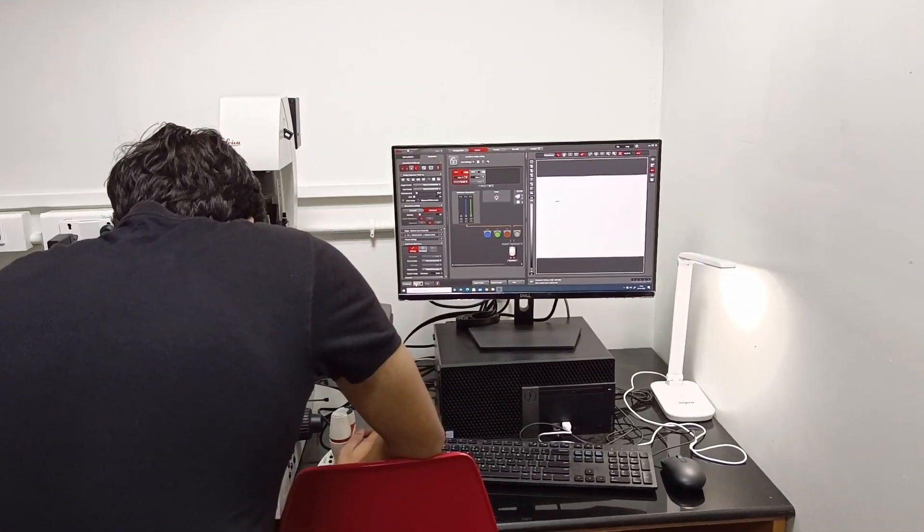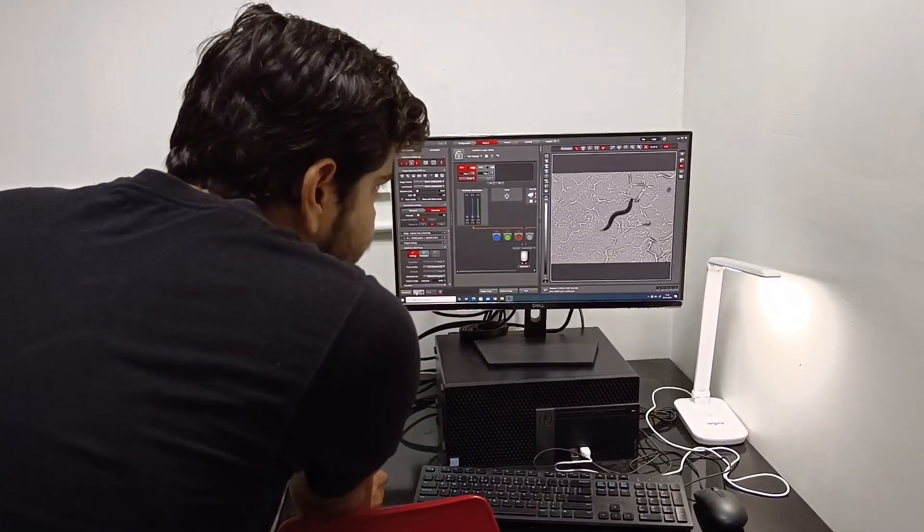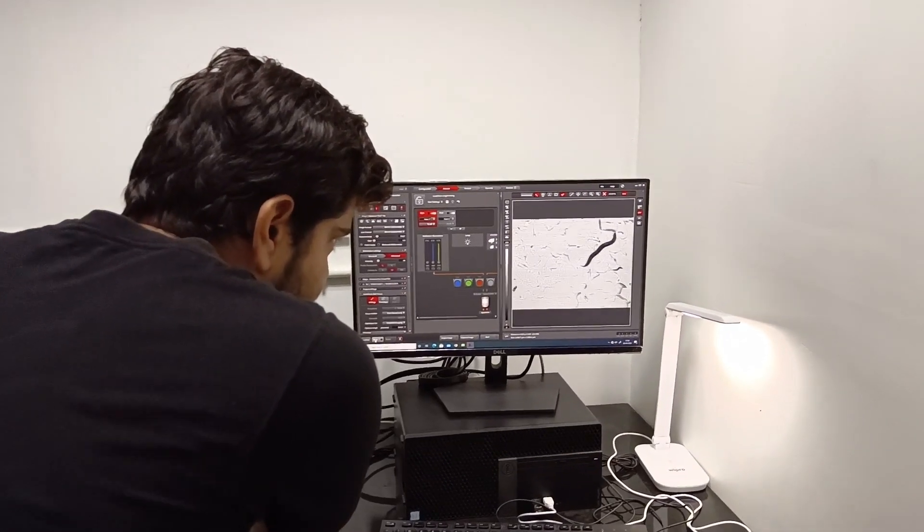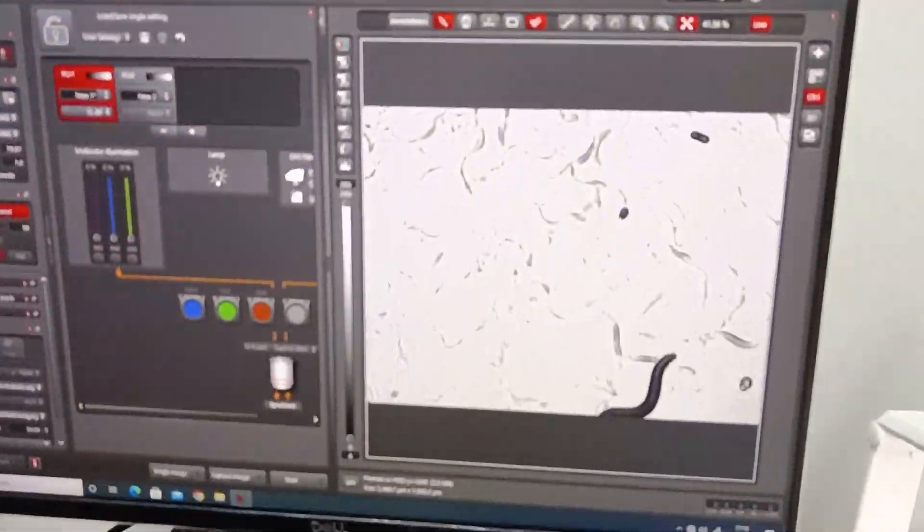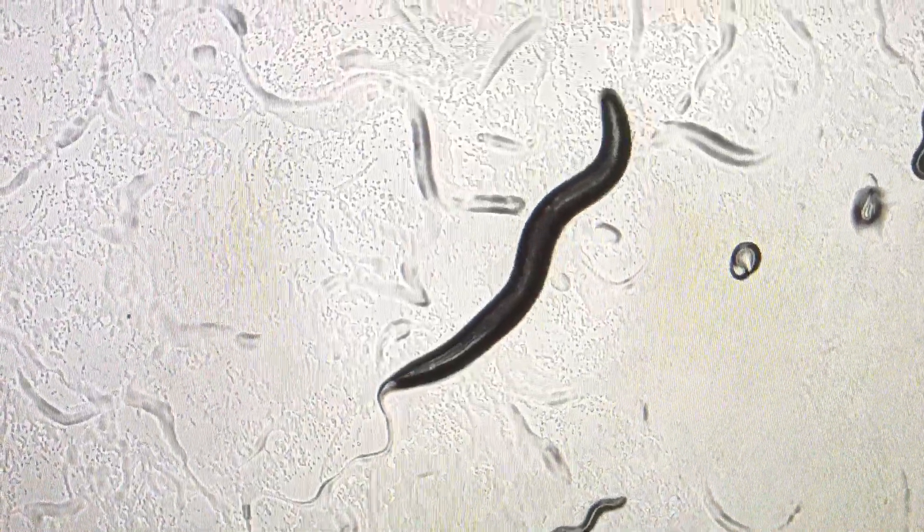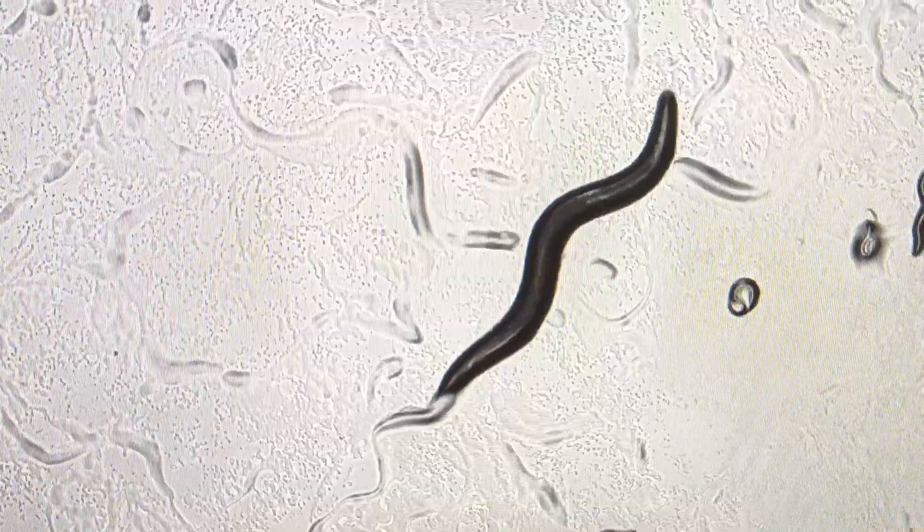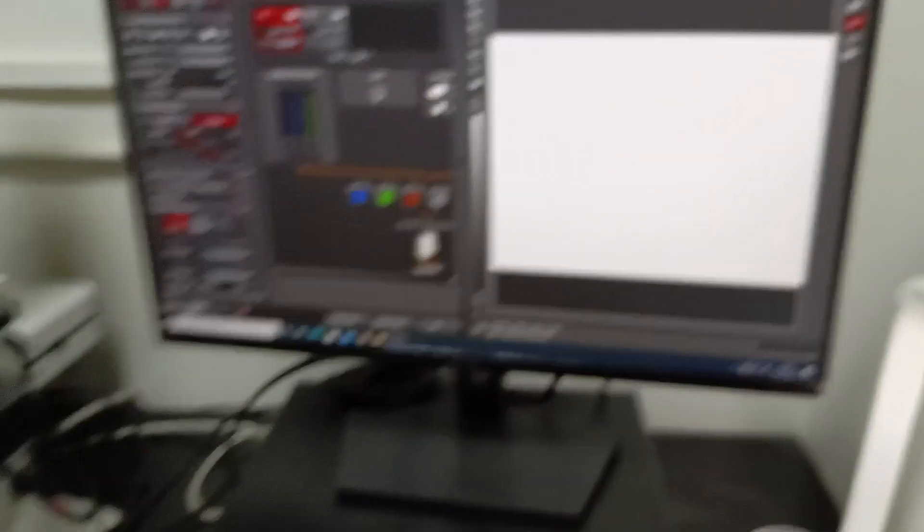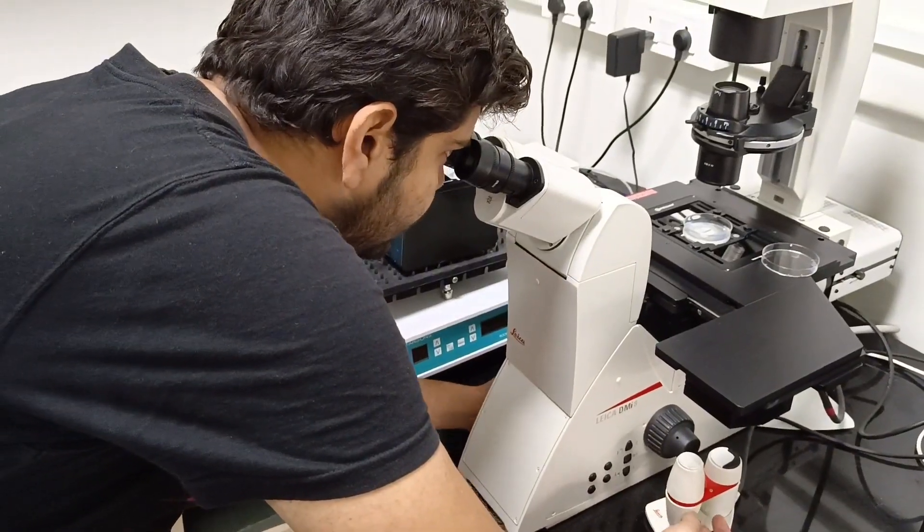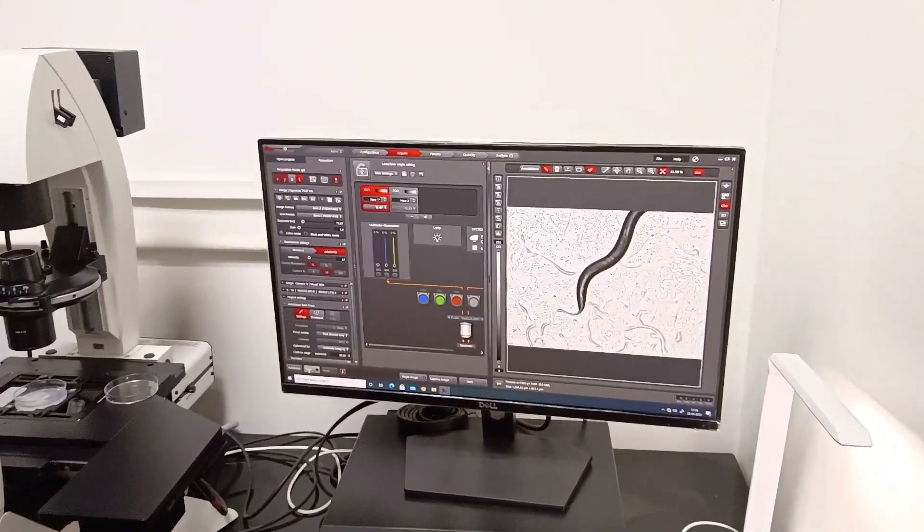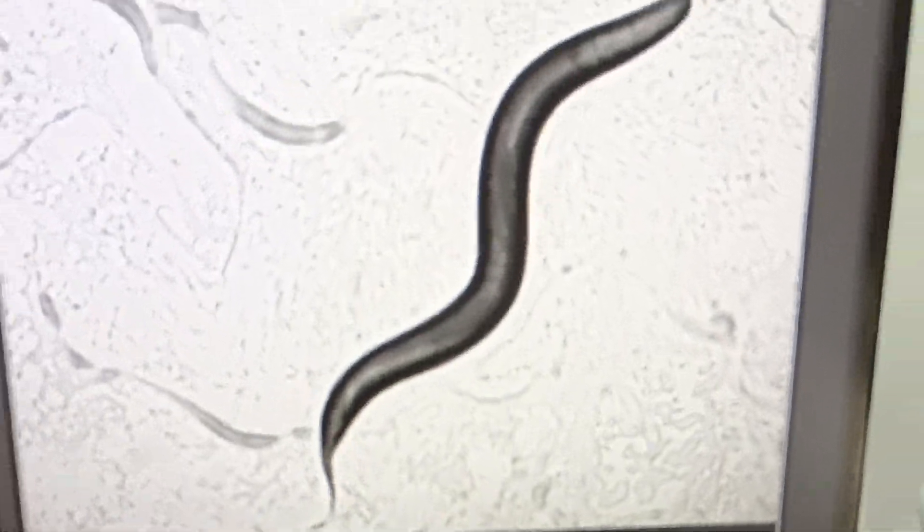So, as you can see on the top screen, this is C. elegans. Basically, this is our model organism which we work and research. And this is a popular model organism in neuro research, in which we have neuro-related studies, aging-related studies. And this is a good model, and why I can show you, if I zoom in a little bit. If you can see, higher resolution, this is a transparent model. Its complete body is transparent.